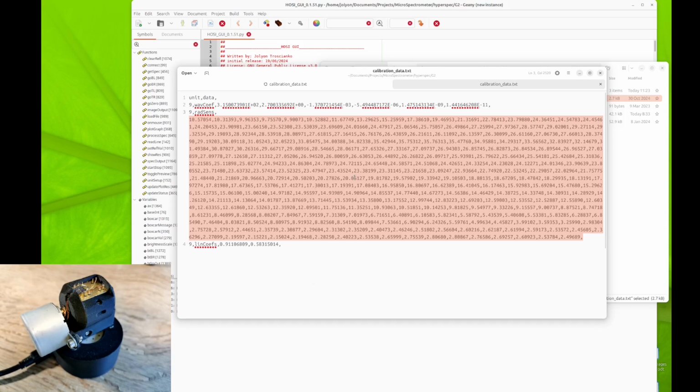They vary a bit between units. How much I can't say because I haven't calibrated quite enough, but you should assume that the calibration is not perfect by using these data that I'm supplying.